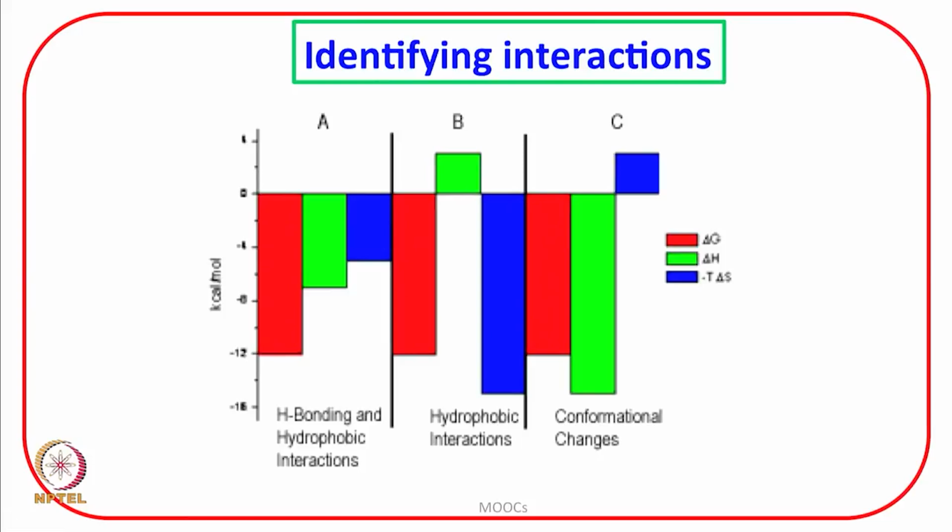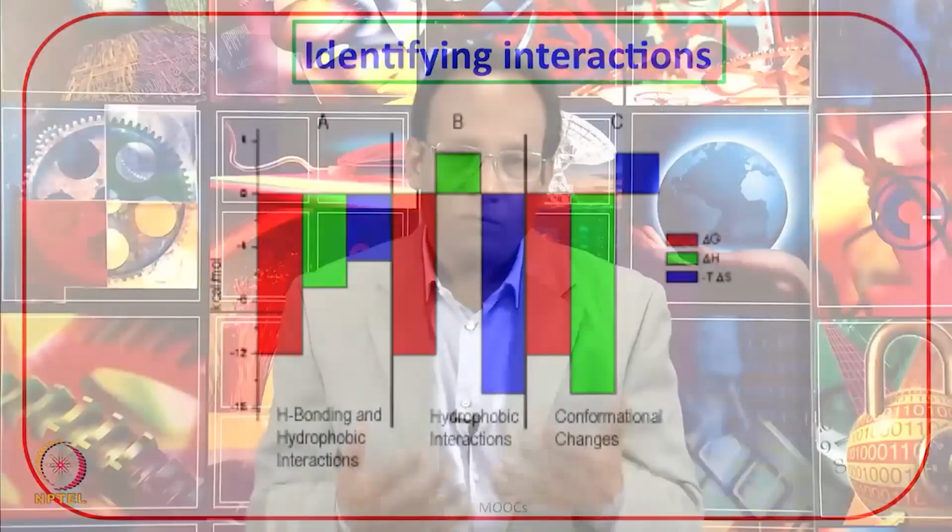Remember that hydrophobic moieties can largely affect the structure of water, because hydrophobic groups would tend to be away from water structure. Therefore, wherever there is an occurrence of more hydrophobic interactions, the entropy changes will also be significant.